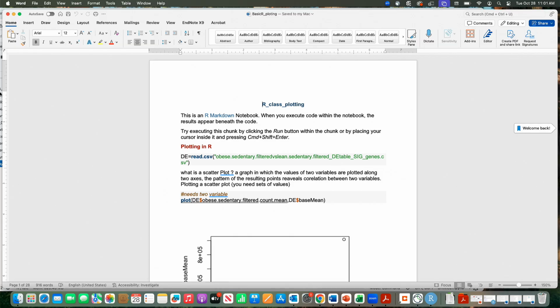Now, Francis was yesterday using that sign, like dash and greater-than sign. He is always programming, so it comes easily for him to type like that. I do it very rarely, so I always use the equal sign. Both the equal sign and that arrow sign work. You can still use equal to also.